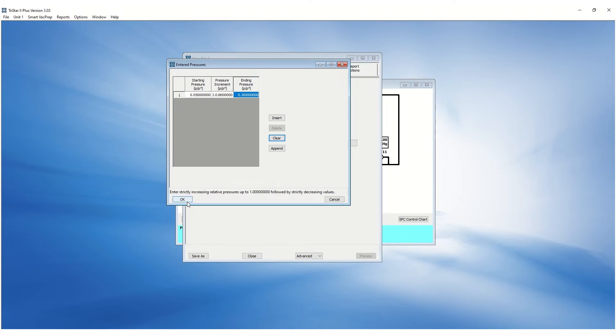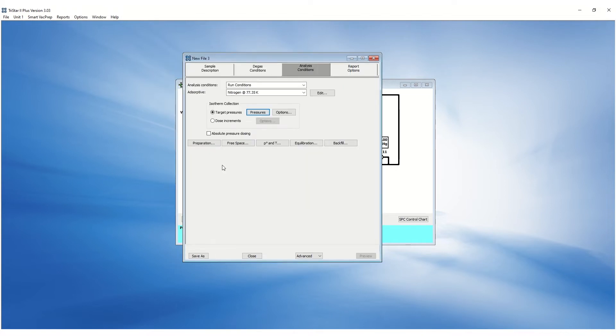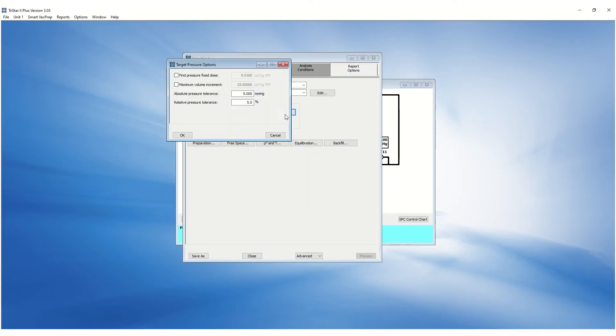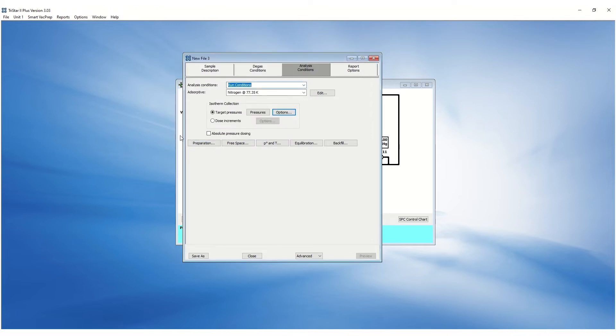The target pressure options allow customization of the absolute and percent pressure tolerance. A reliable nitrogen isotherm can be obtained with five millimeters of mercury of absolute pressure tolerance and five percent of relative pressure tolerance. Absolute pressure dosing is available when the saturation pressure is not applicable.